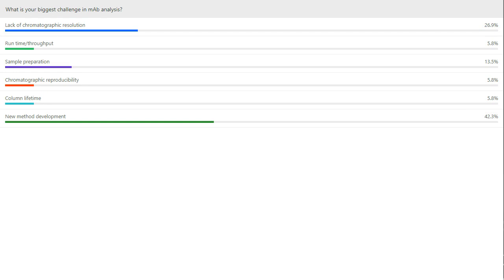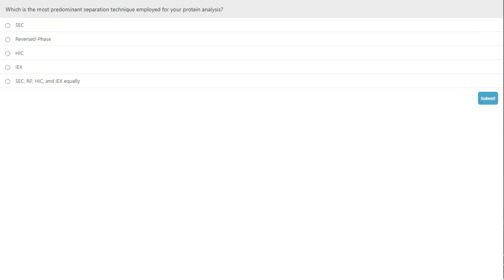So let's move to our next polling question now. What is the most predominant separation technique employed for your protein analysis? SEC, reversed phase, HIC, ion exchange, or all of those techniques, SEC, reverse phase, HIC, and IEX equally? So again, you can click directly on your screen to enter your answers, just as you did last time. Which is the most predominant separation technique employed for your protein analysis?